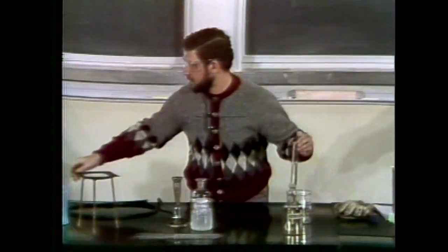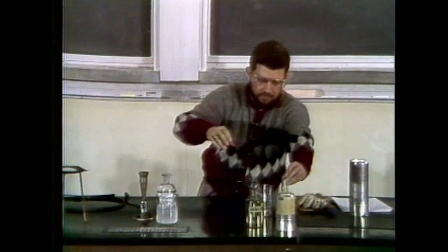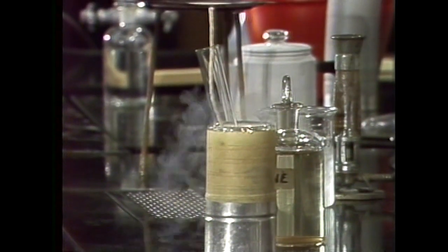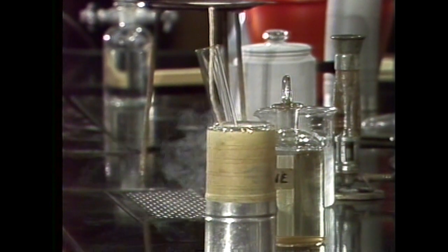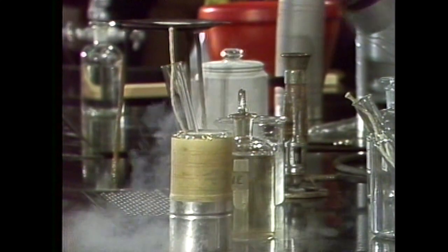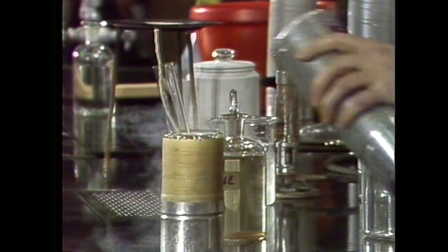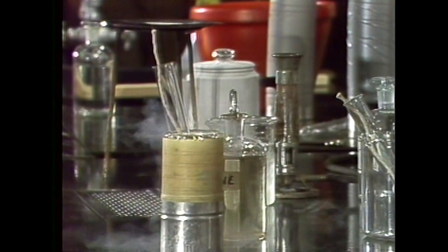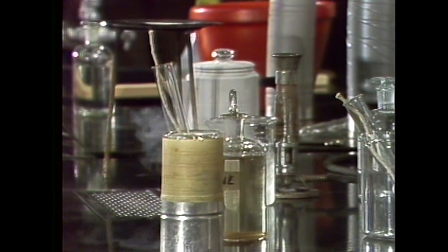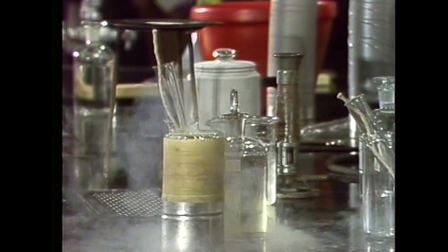And what I'm going to do is let this kerosene freeze. So I'm going to put it in this. Okay, somebody will get it to work fairly quickly. I can't do it from here, you know that, right? I'm having enough trouble as it is by myself. Keep running out of this good stuff here. There we go. Okay, we'll let that cool down for a while.